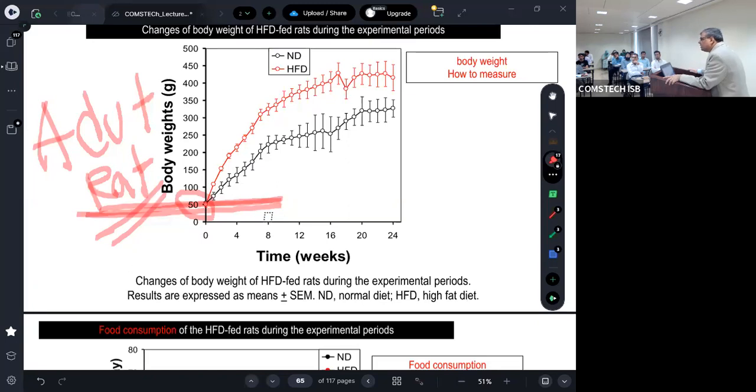Okay, I'm giving a high-fat diet. Normally, if you take biryani today, 1 day, 2 days, 3 days, on the 4th day you will not like it. My student told me this story, sir, it is very difficult. Normally they monitor the rat's weight every day and how much food it is taking. Then it was our second experiment. In the first experiment we used adult rats and found many difficulties, though we got some results. So we used weaning rats.